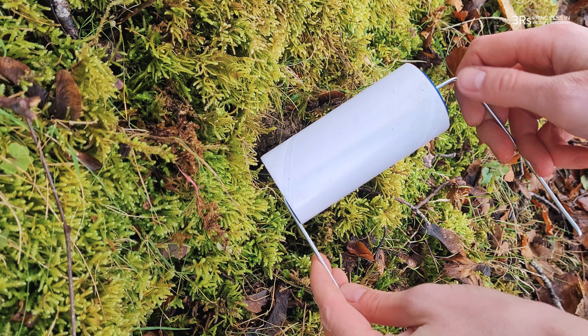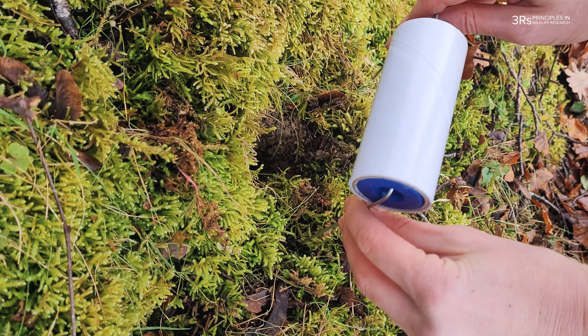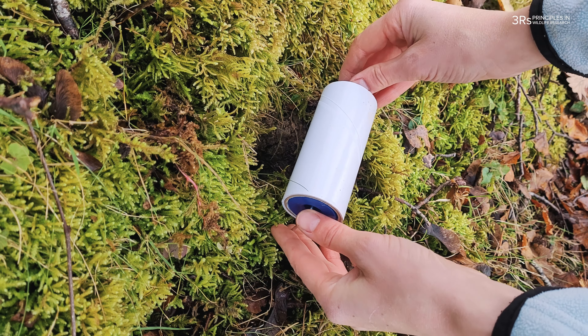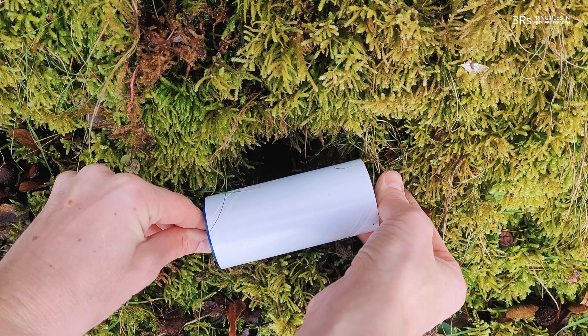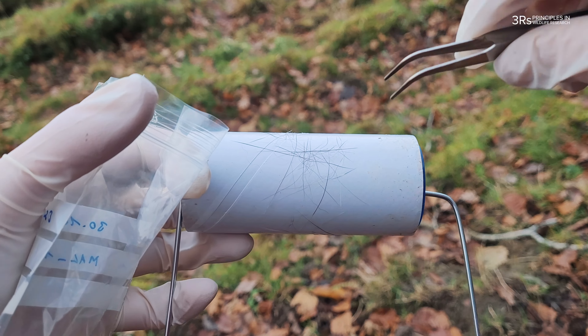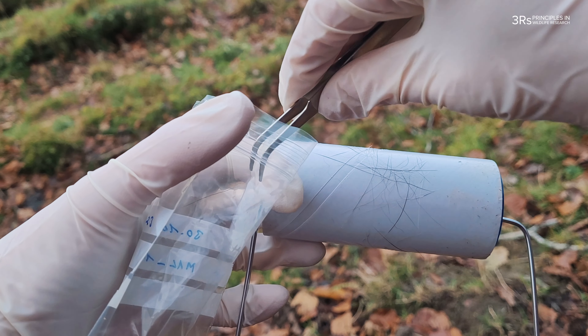For smaller mammals, such as voles or hamsters, you could use a homemade trap consisting of a plastic tube with a double-faced tape. Place the trap at the entrance of the animal's burrow. Be very careful to use a tape with glue that is not too strong in order to prevent the animal from getting stuck. When animals enter or exit their burrows, they deposit hair on the tape.